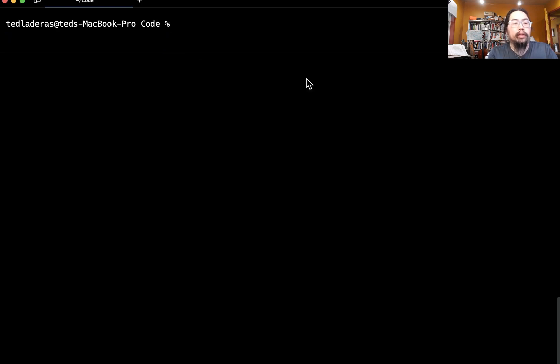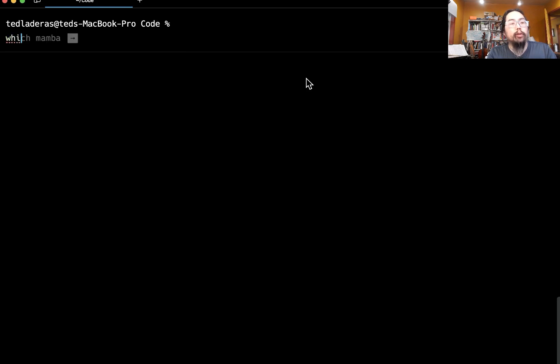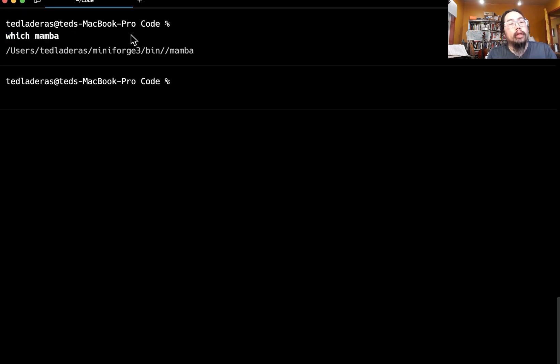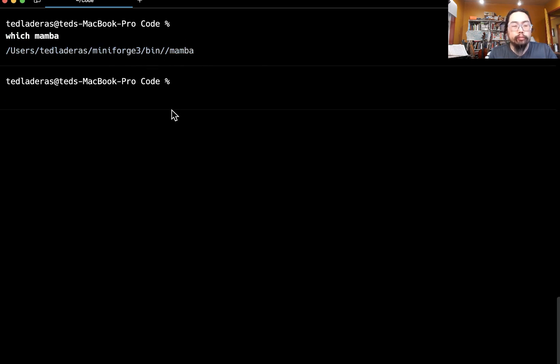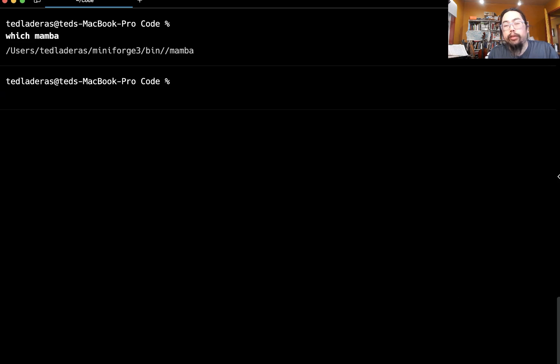So now we're on the command line. And the first thing I want to do is I want to check that my Mamba is installed. So I'm going to do a which mamba. And you can see that it's in my path here. So now we want to do the installation.